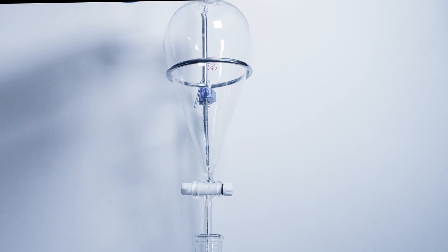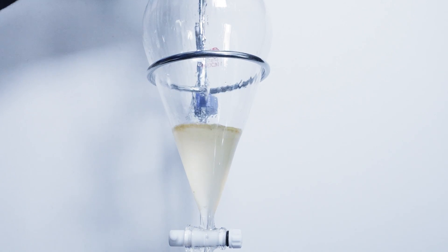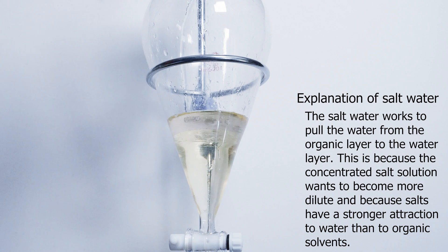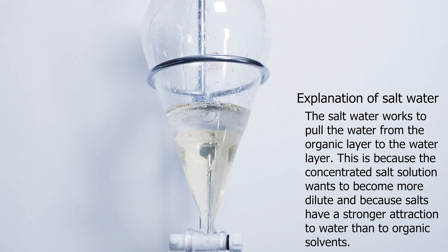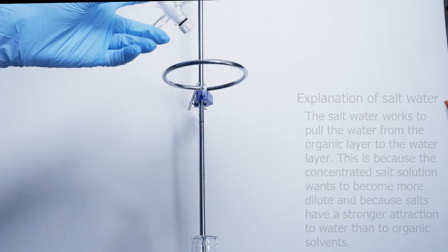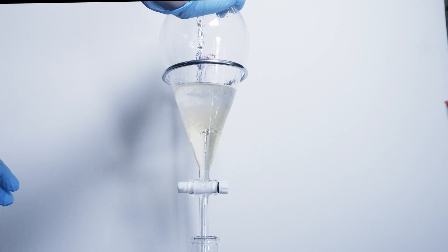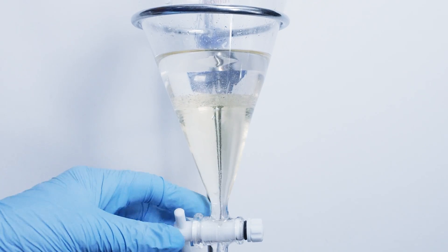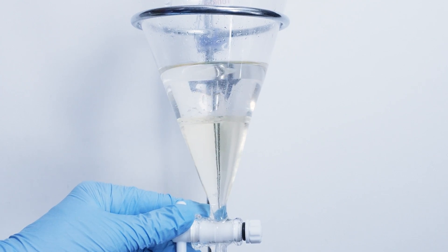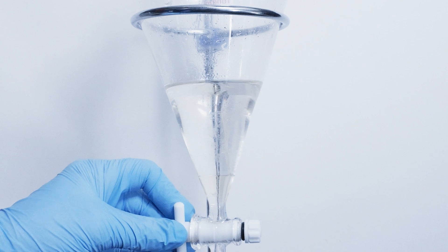Once I clean my separatory funnel I pour all of the DCM back in, which is naturally cloudy because of impurities. Following this I add some extremely cold and super saturated salt water. This will help to further dry the DCM from any water or other impurities within it — and instantly it starts to clear up when I add the super saturated salt water. I cap, shake, and vent my funnel just like before, and afterwards we can really see how much it cleaned up. I then drained my DCM into a flask filled with molecular sieves, but honestly I used too many sieves and they absorbed about 30% of my DCM. These sieves are meant to dry the DCM further from any remaining water, however it was clear to me that too many sieves was an issue.